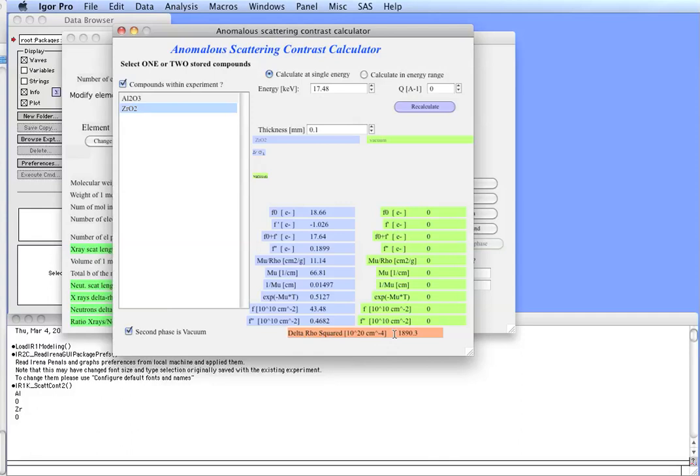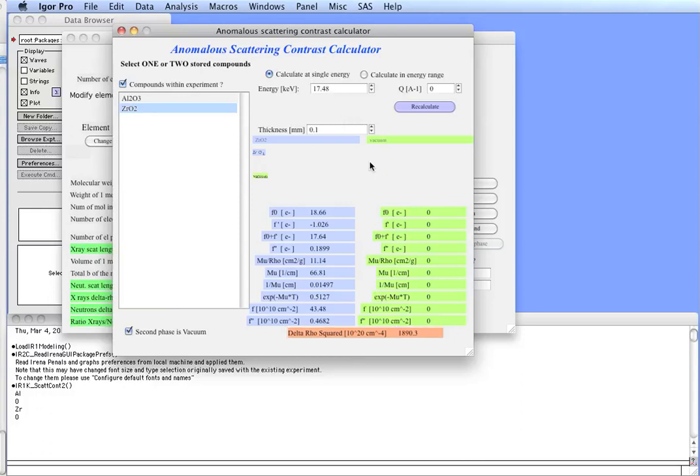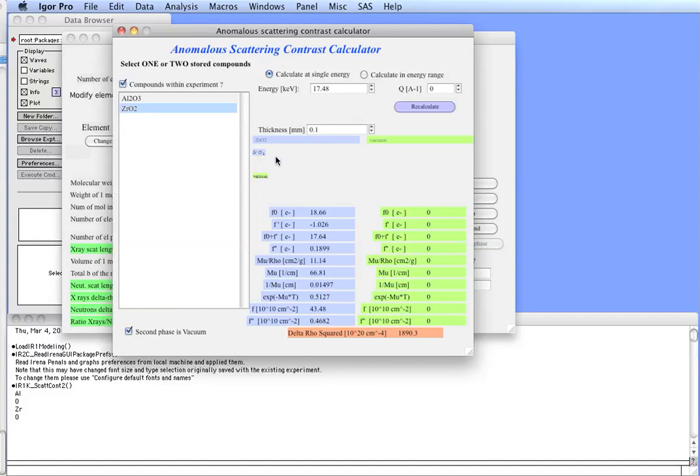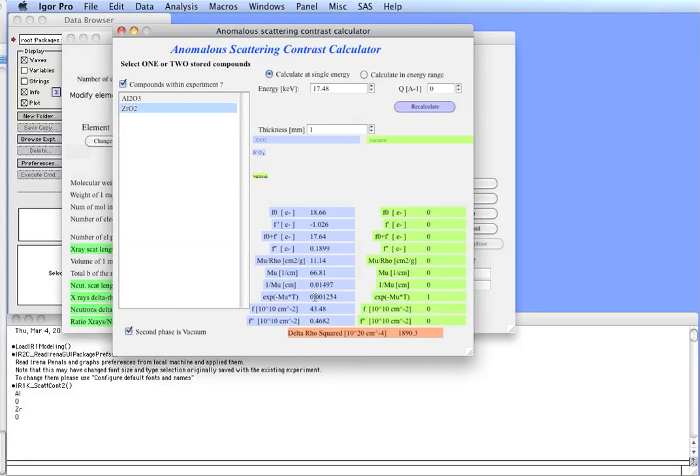Your delta rho square, your contrast in this case, would be 1890.3, 10 to the 20. I don't know if you remember from the previous panel, but the free electron approximation is 2100. It's a significant difference for this specific energy. The other really interesting value in this table is the e to the minus mu T, which happens to be translated for any sane person as transmission. So, basically, this tool is telling you that your 100 microns of fully dense zirconium oxide will have about 51% transmission at this energy. So, if you have 100 microns thick sample, you can probably do the experiment. For example, if your sample had one millimeter thickness, your transmission would be 001, which is 0.1%, and the experiment probably would not be particularly doable.